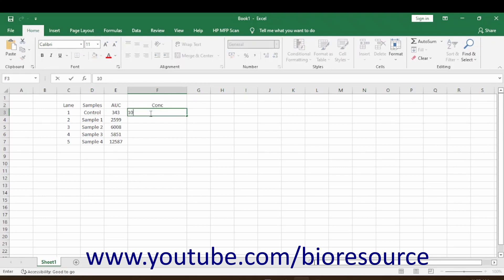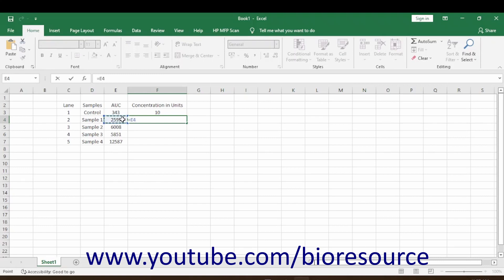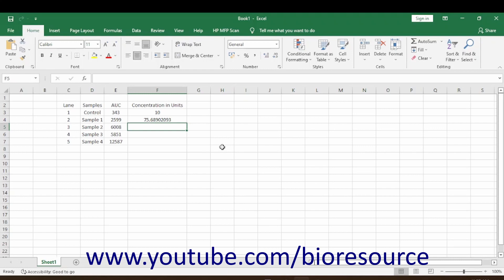The control concentration is 10 units — so concentration is expressed in units. Here, you know that an area under the curve of 343 corresponds to 10 units. Now let's find out what the number of units is when the area under the curve is 2599. Just cross-multiply to calculate that, and do the same for the others as well.